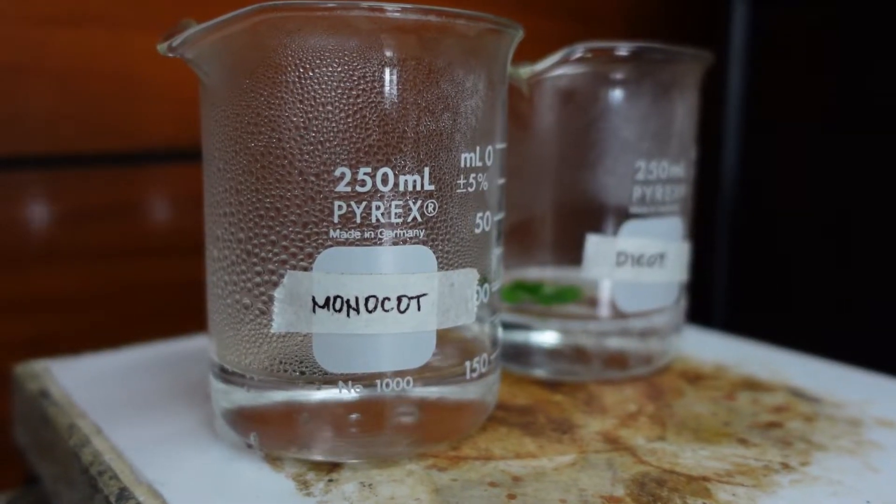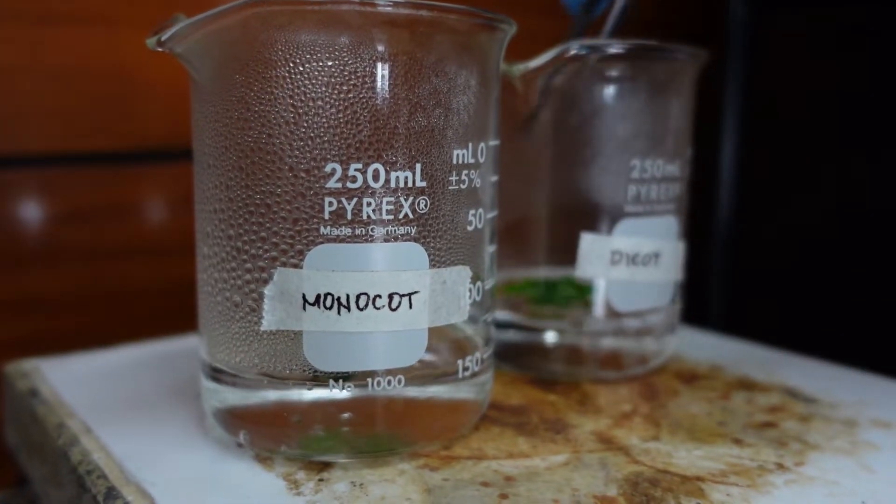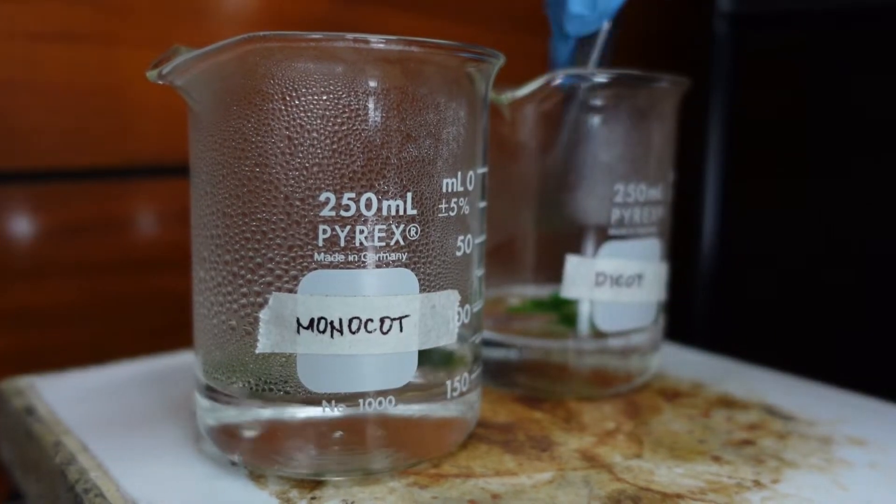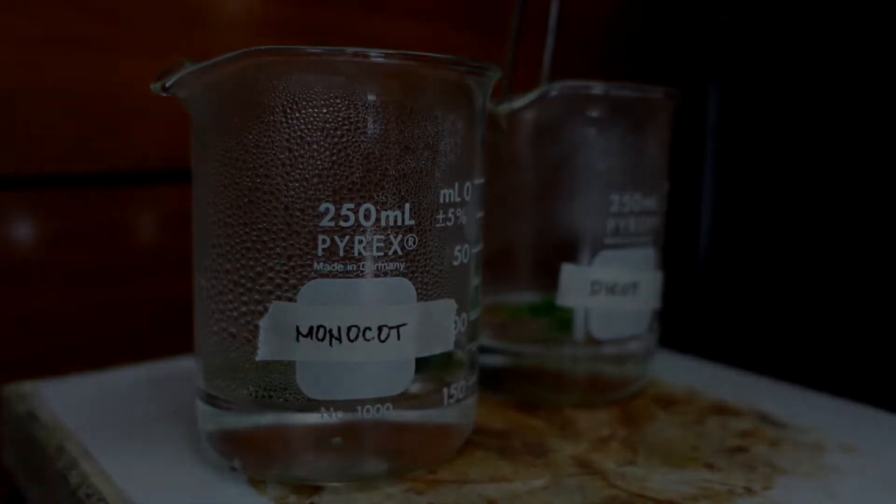Boil the weighed leaf of each species in separate beakers with 50 ml water for 10 minutes. Don't forget to use distilled water.